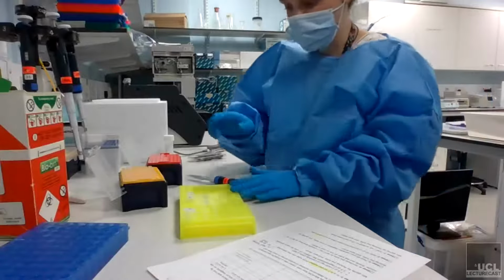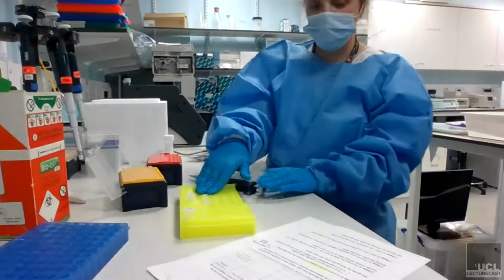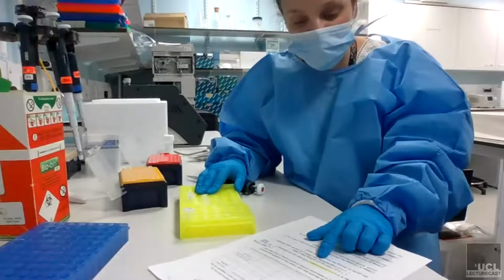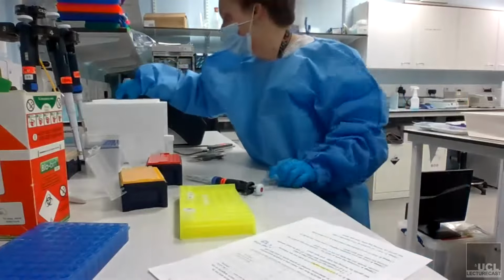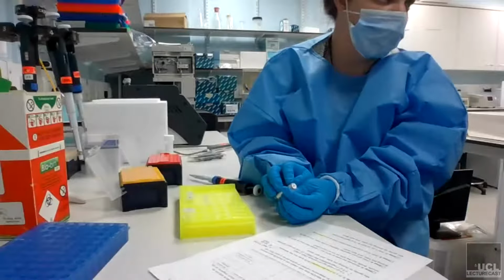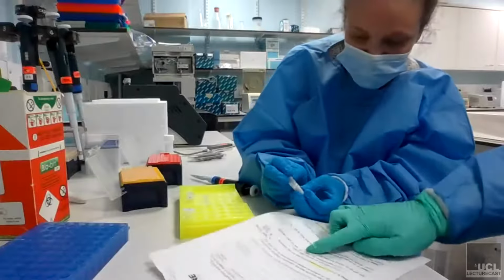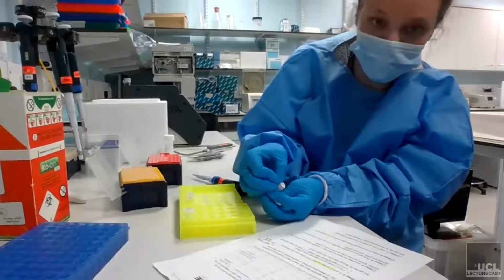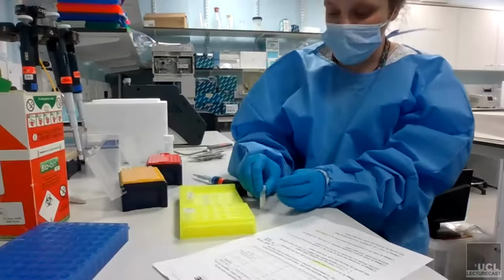Right, so we've made our samples. So now what we're going to do is add 2.5 microliters of what they call fragmentation mix, but on the tubes they're called RB01, and what that means is rapid barcode, I think, basically. It says fragmentation mix there on the side, but also, as I say, on the top they say RB 1, 2, 3, 4, 5, 6, 7.